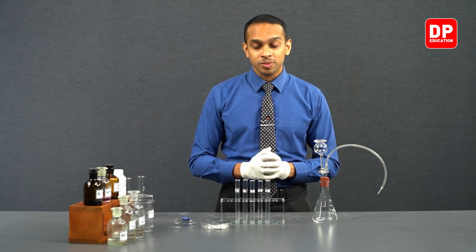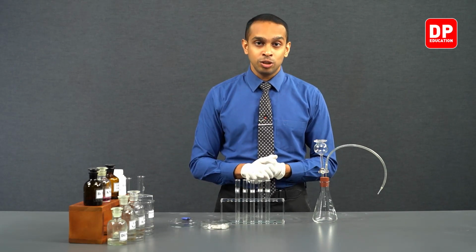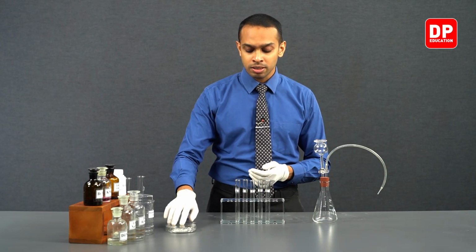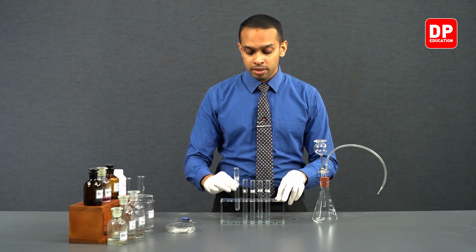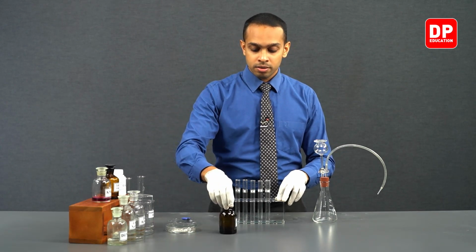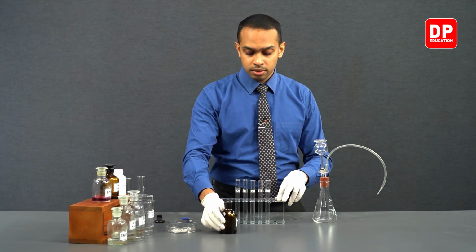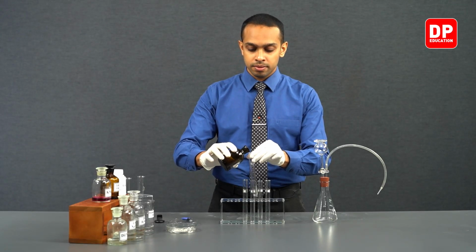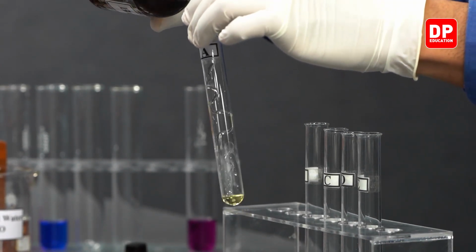Students, now all that is left for us to do is take these reagents into each of these test tubes. As we did in the previous experiment, we are going to first take into test tube A a small amount of bromine water. We have bromine water here. We are going to take our test tube A and add a small amount of bromine water.